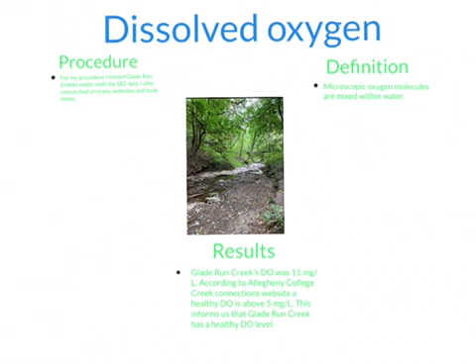Dissolved oxygen. Procedure. For my procedure for dissolved oxygen, I tested Glade Run Creek's water with the dissolved oxygen test. I also researched on many websites and took notes. Definition. The definition of dissolved oxygen is microscopic oxygen molecules that are mixed within water. Dissolved oxygen is found in the spaces between water.